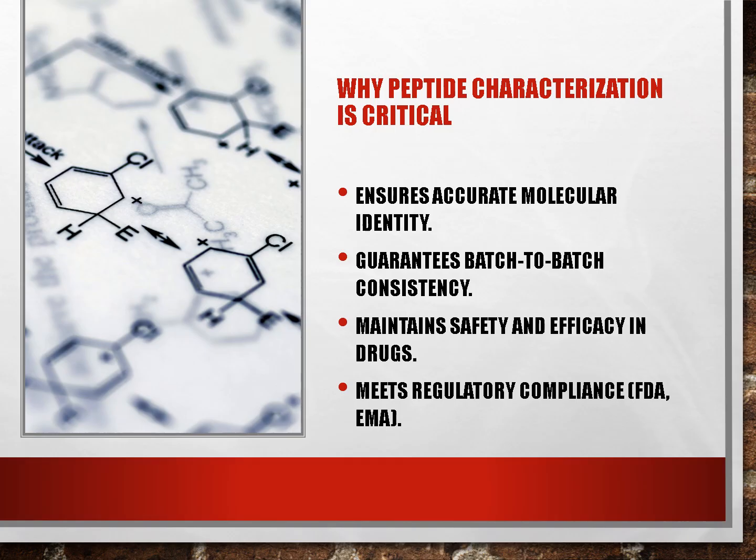It's also a regulatory requirement. Agencies like the FDA and EMA demand rigorous analysis before therapeutic peptides can reach patients. Skipping characterization can lead to false results, compromised clinical outcomes, and even regulatory setbacks. So, this isn't just a technical step. It's a vital part of ensuring quality and reliability.